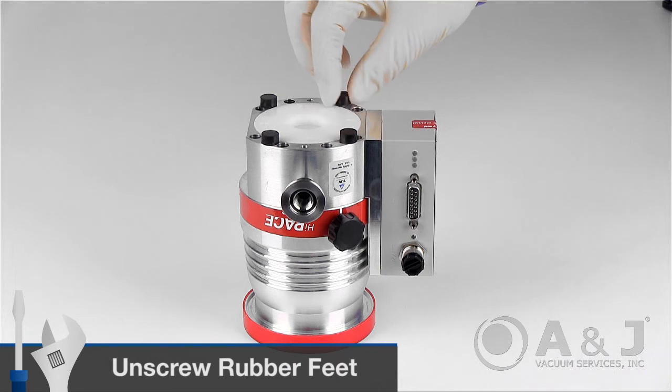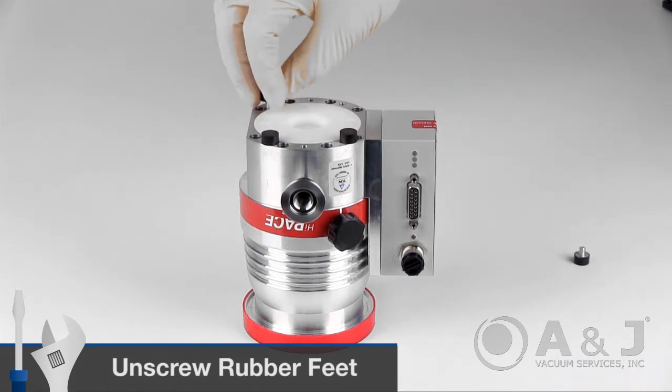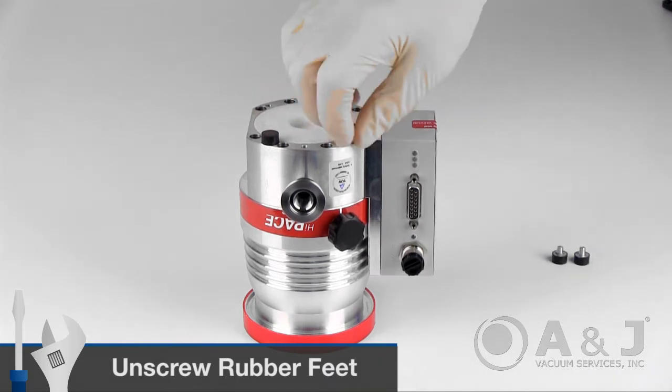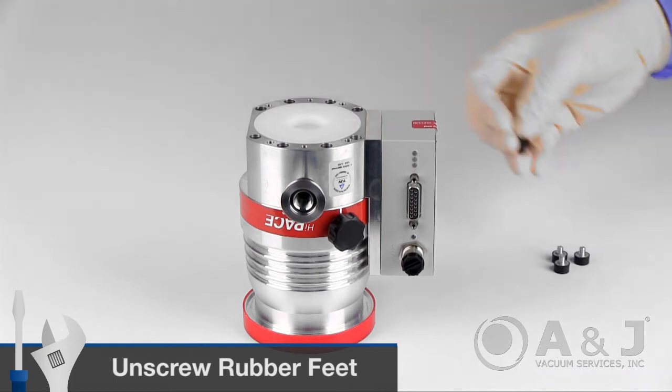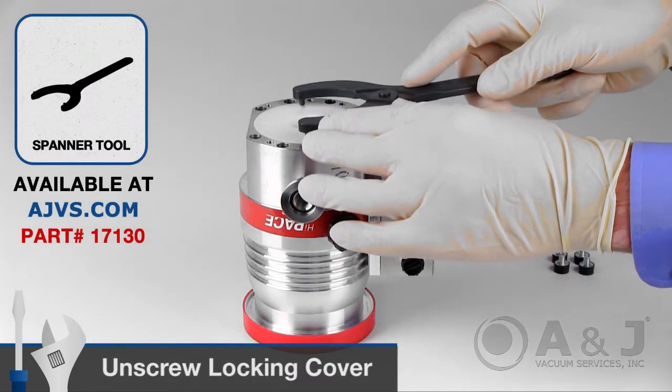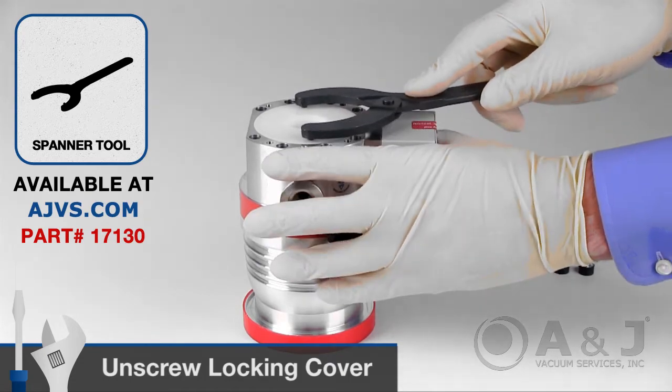To begin, unscrew the rubber feet from the bottom of the pump. Unscrew the locking cover on the underside of the turbopump with the special spanner wrench tool.